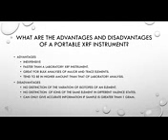The advantages of a portable X-ray fluorescence spectrometer is that it is a fairly inexpensive instrument. It costs roughly $75,000 to $125,000 to obtain. Portable X-ray fluorescence spectrometers are faster than laboratory X-ray fluorescence spectrometer instruments. Portable X-ray fluorescence spectrometers are great for bulk analyses of major and trace elements. The results of a portable X-ray fluorescence spectrometer tend to be in higher amount than that of laboratory analysis using X-ray fluorescence spectrometers.